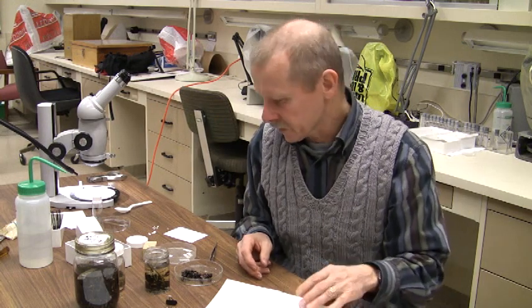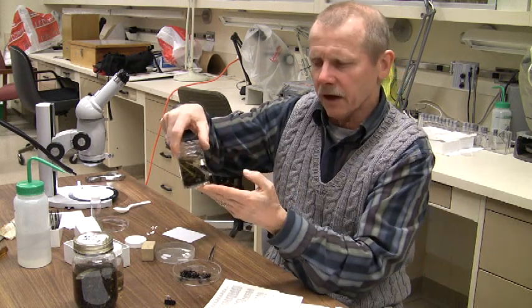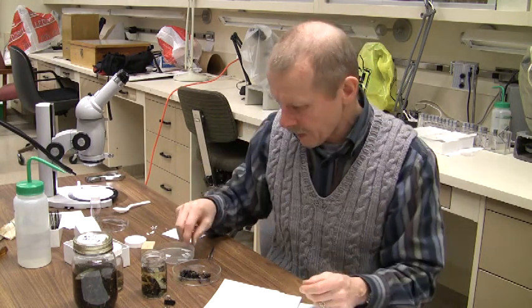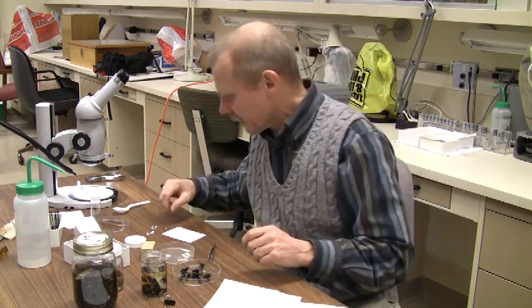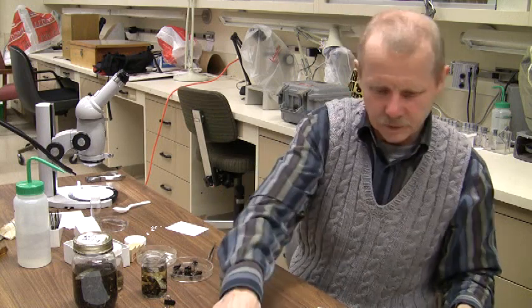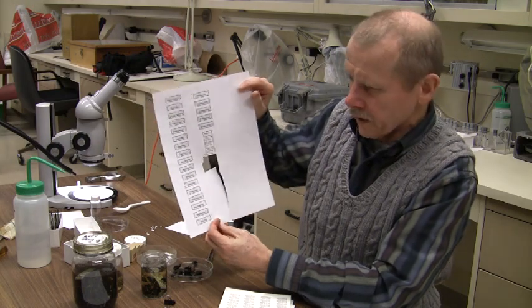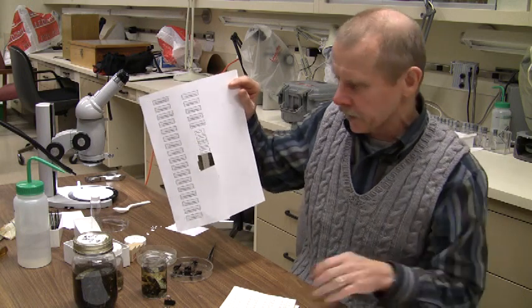The easiest place to start is with some of the larger insects. When you get started, take your vial or jar with the larger insects, dump them out, and you and your partner can look through them and decide which ones you want to mount. You also have a sheet of paper here with the actual ordinal names, which we'll use later when organizing your collection.